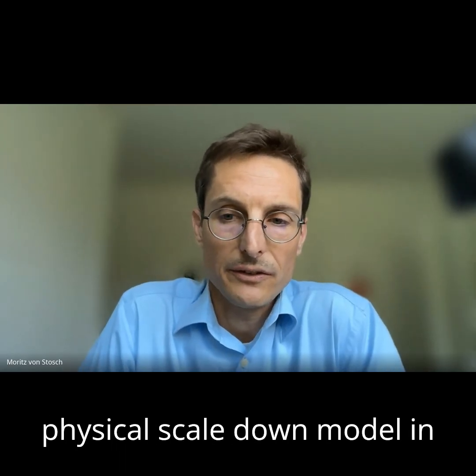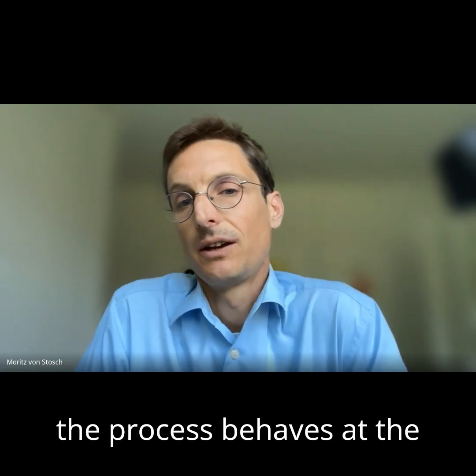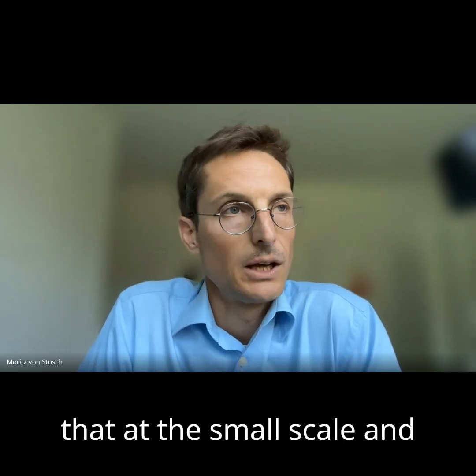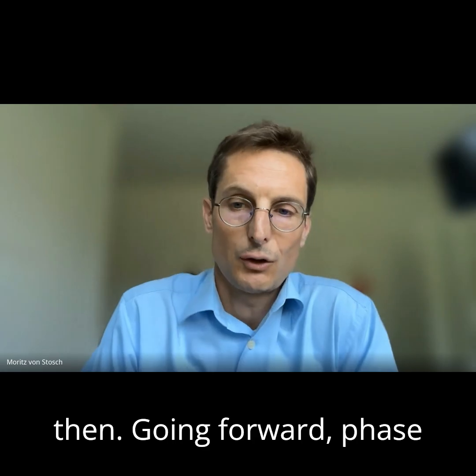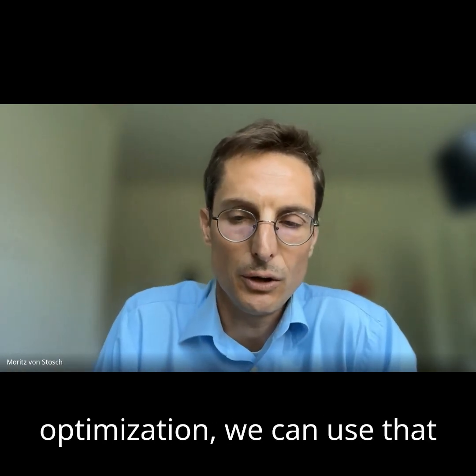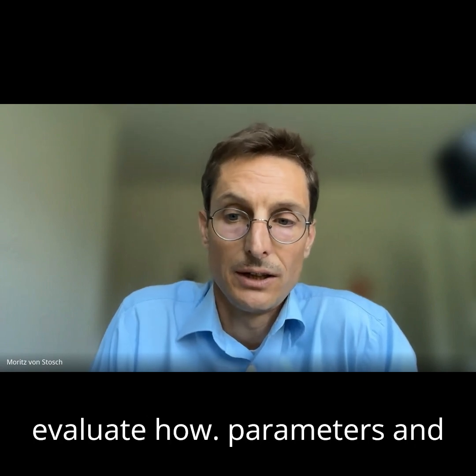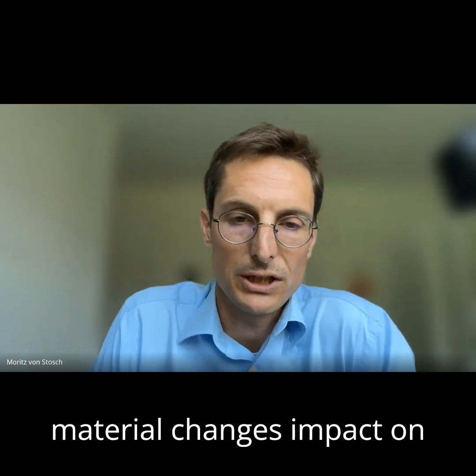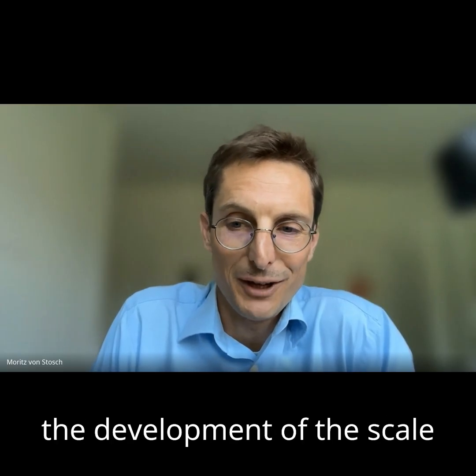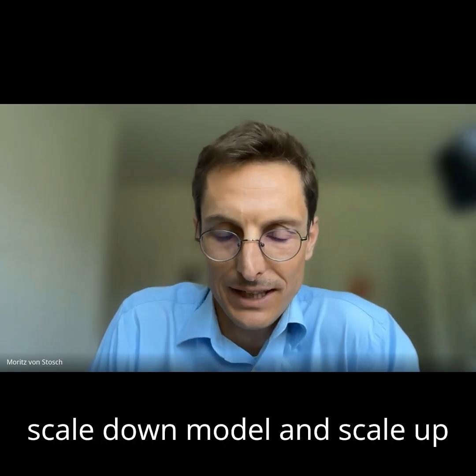And this physical scale down model in principle should emulate how the process behaves at the larger scale, but emulate that at the small scale. And then going forward, phase 2, phase 3 activities where we come into process characterization and into optimization, we can use that scale down model to really evaluate how process parameters and material changes impact process performance. But the development of the physical scale down model, and scale up as such, is still a challenge.